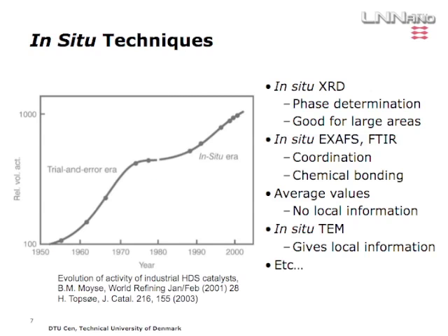And if you look a bit back in history, and again this is from the catalysis world, from the 1950s up to about the 70s, most catalysis studies were done by trial and error experimentation. If something didn't work, you tried something else. And okay, you can improve your performance. This here shows the relative activity by volume of a hydrodesulfurization catalyst. Just by doing regular trial and error, you take the best catalyst and you try to do something to that, and then you make it better. But that has kind of a limit.